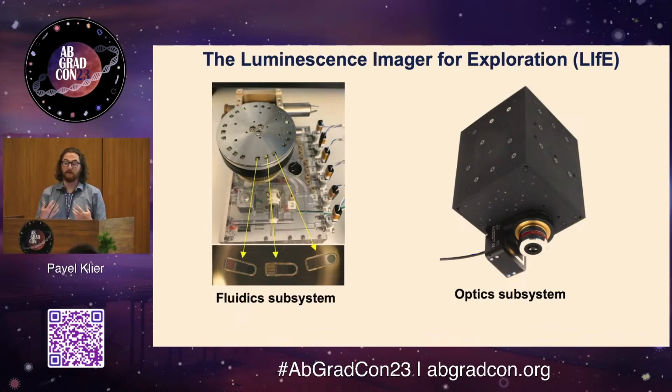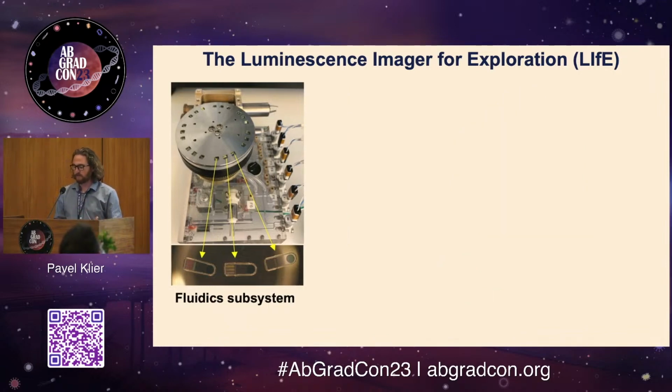My background, full disclosure, is actually not in astrobiology. It's in fluorescence microscopy. I spent five or six years in grad school just moving fluids around in tubes and preparing things on slides before they actually get to the microscope. I've been told it would be expensive to send me to Enceladus, so this is my replacement. The other end is the actual microscope itself, the optics system, which has everything you need to take your pretty pictures. I'm going to break down what goes into these systems a little bit.